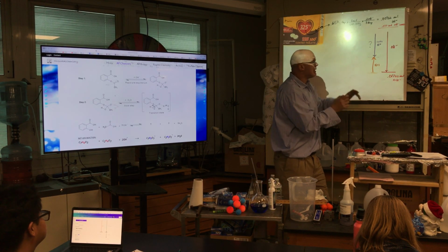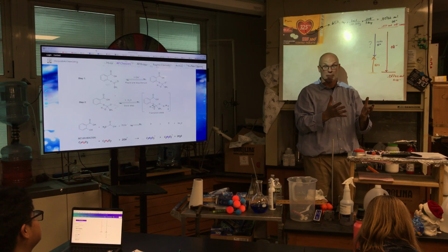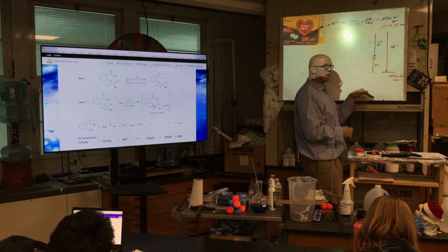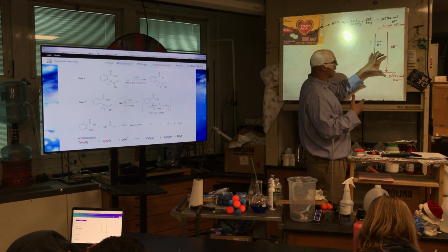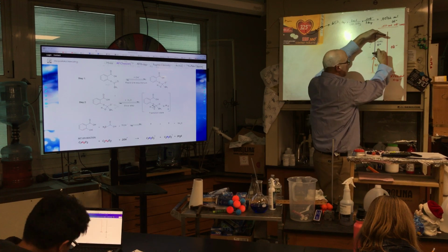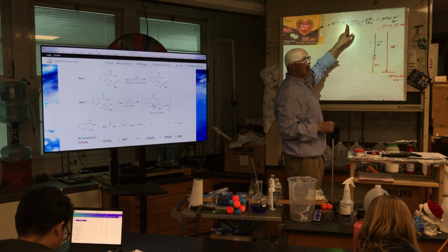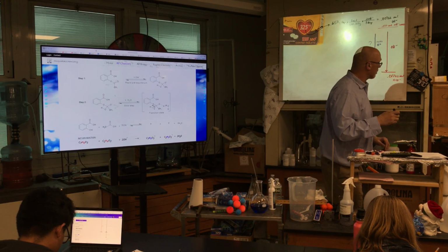Does that make sense? I need this number. I need to know this number. Just like your Tums lab, except in the Tums lab, we added H+. We back titrated with hydroxide. Hydroxide moles equal the extra H+. We subtracted from that number, and we got whatever this number was. We went backwards. In this case, divide by 2, times by 180, and we get the tablets. This is an important number. Does everyone agree?